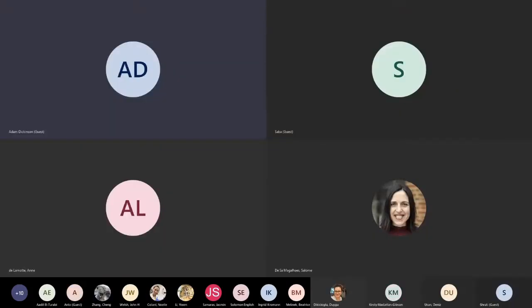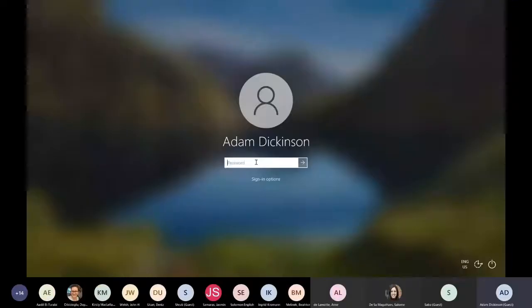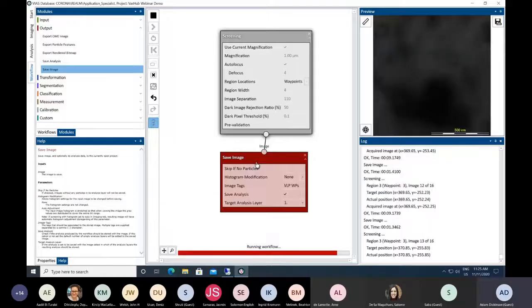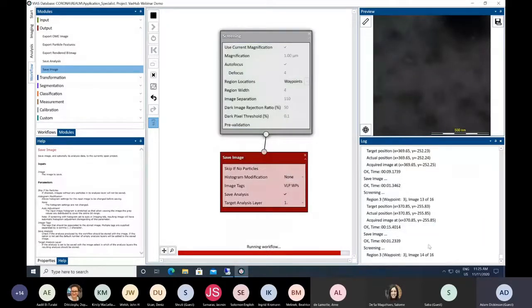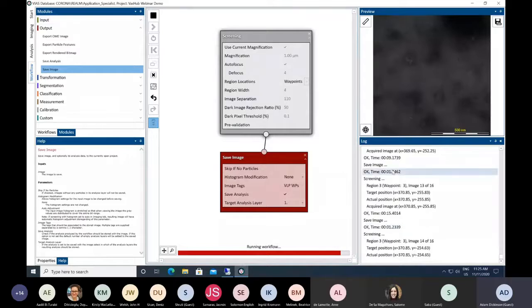Okay, right, now hopefully we'll switch back to the MiniTEM system and see how we've been getting on. Log back in. It's nearly finished. We're quite close now. Timed that, not too bad. So obviously you can now see there are images populating in the preview page.